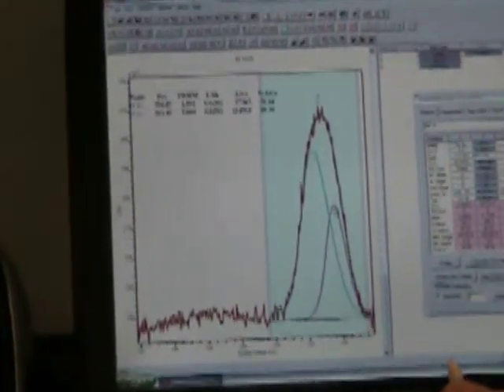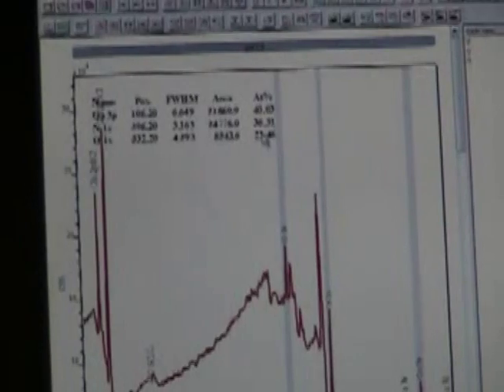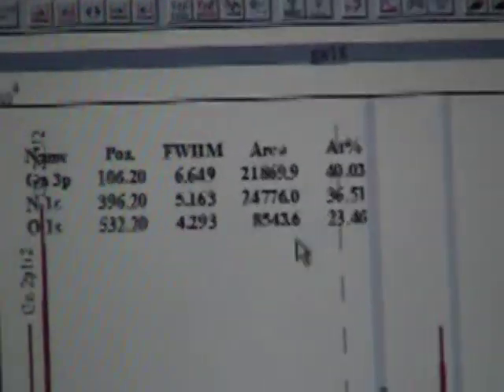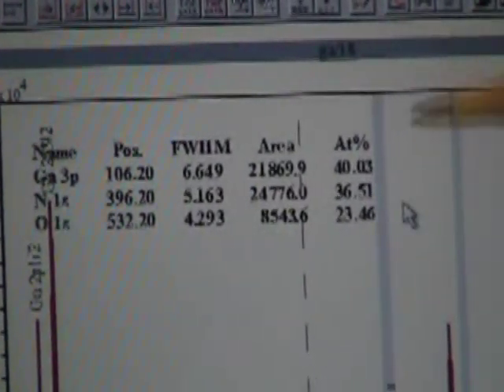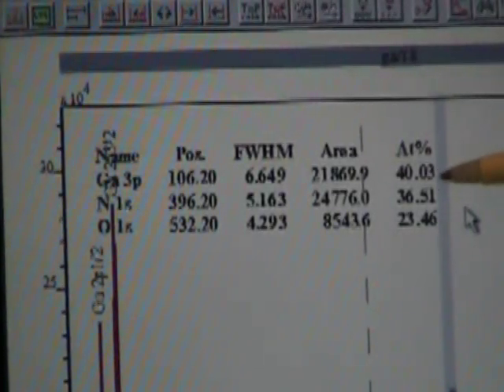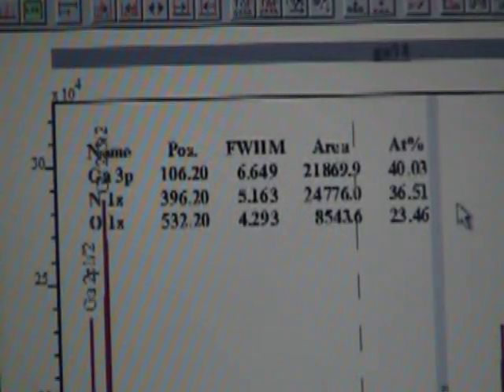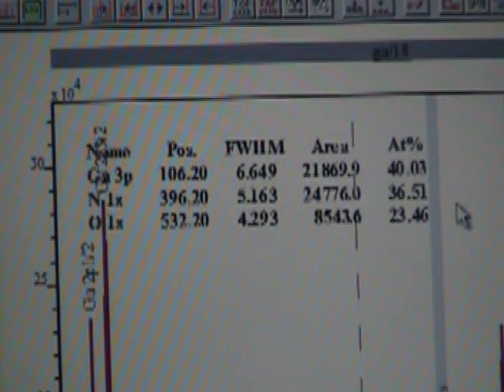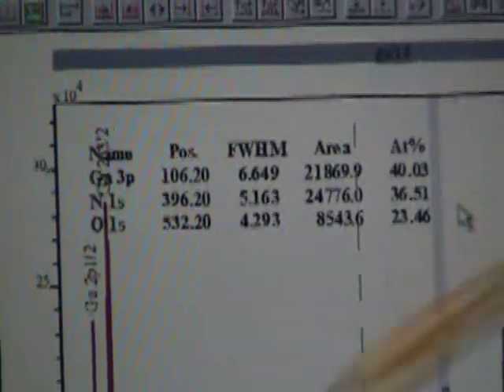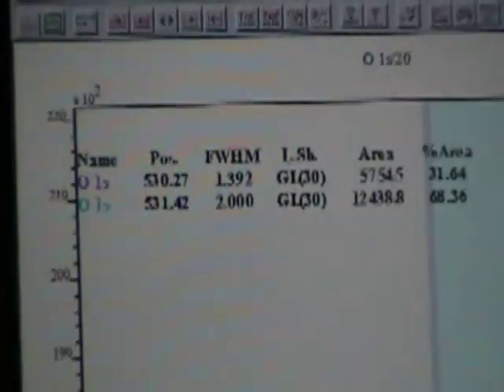But at any rate, what we see is about a third of our oxygens, or 30%, a little bit less than a third, are actually bonded to metal. And since the only metal in this sample is gallium, they must be bonded to gallium. So when we go back now to our survey, we've got 23 oxygen atoms, about 30% of which are bonded to gallium. That's about seven oxygens. And those seven oxygens are chasing after about three and a half galliums, because remember we have 40 galliums and 36 and a half nitrogens only. So we've got about three and a half galliums that are uncompensated. The molecular formula for gallium oxide is Ga2O3. So those three and a half galliums should require about five oxygens to be fully compensated as an oxide. And here what we're saying is we've got about seven oxygens that look as though they're bonded to gallium. So that's a reasonable amount of error, given that now we're getting down to these smaller peaks.